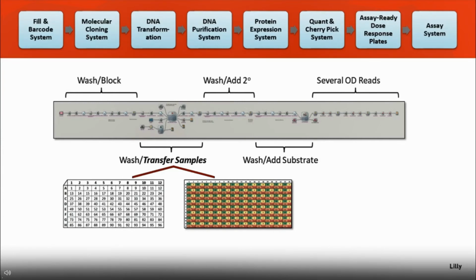You do see a lot of steps in this process for a somewhat basic ELISA. And I would say that is because of all the weigh steps. Every weigh step is a node, and then the script to analyze the weigh step is another node. So before and after all these liquid handling steps, you're seeing a balance step followed by a script node. And so this method is significantly larger than you might see on another SAMI-based system.